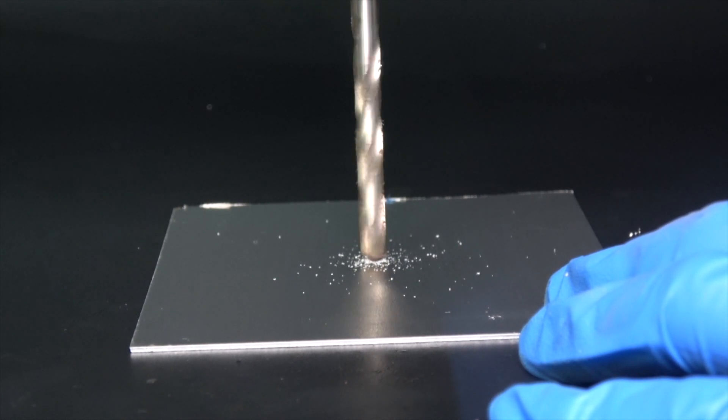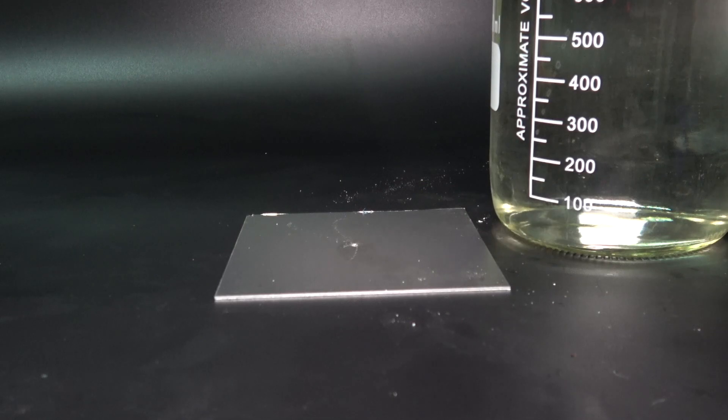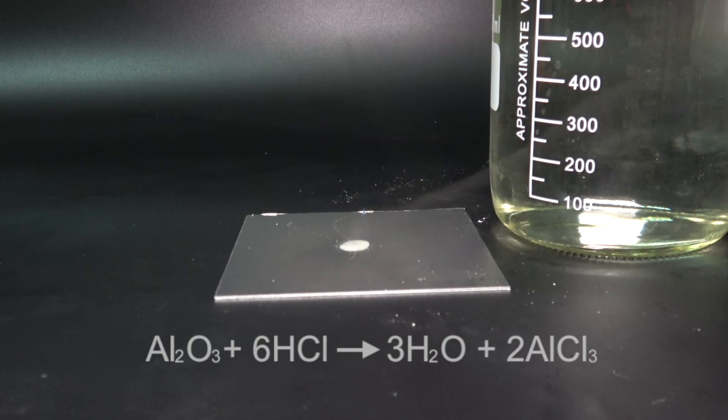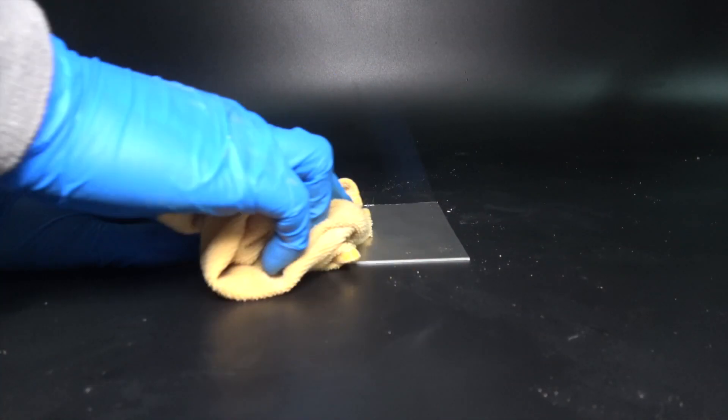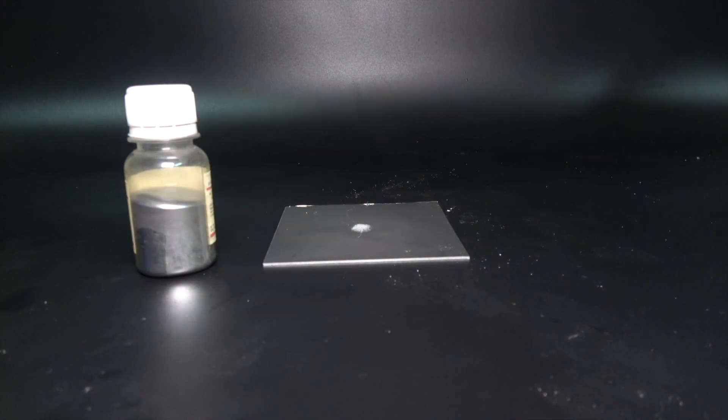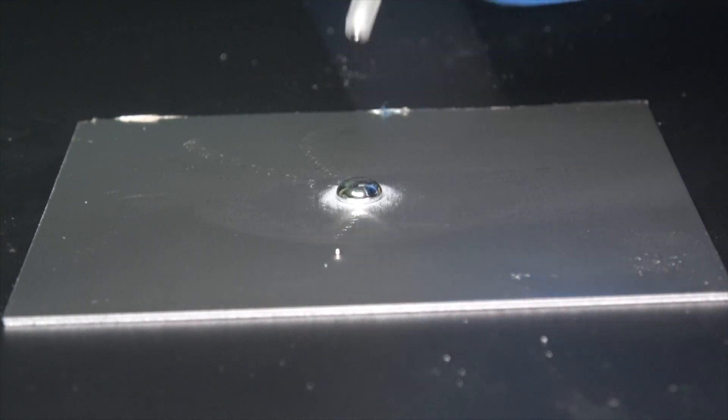So I drew a hole to expose the fresh metal underneath. To further ensure the metallic aluminum is well exposed, I added a few drops of hydrochloric acid. This will serve to get rid of any remaining oxide layer by turning it into aluminum chloride, which dissolves away in the solution. I got rid of that after letting it sit for a while.